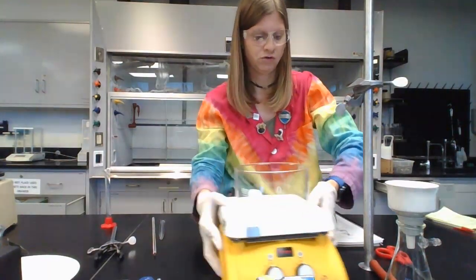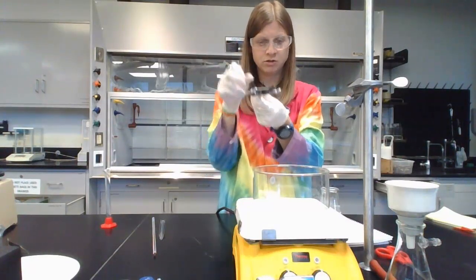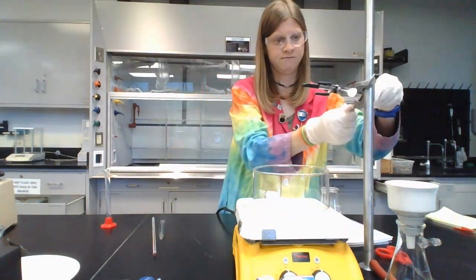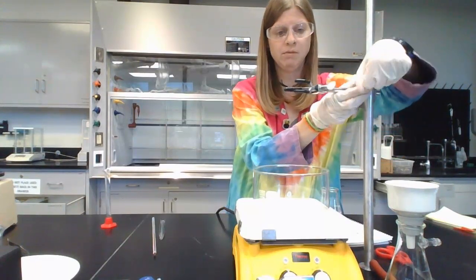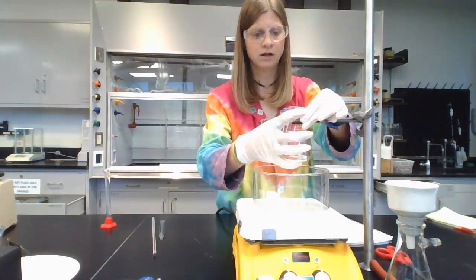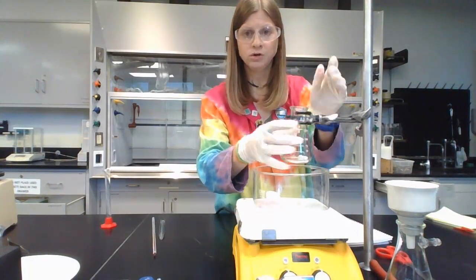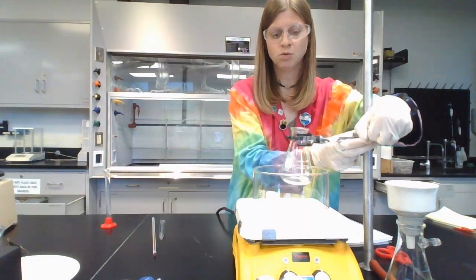I'm gonna scoot you over. And then I'm gonna get a finger clamp, call it that because it looks like a thumb and 2 fingers to me, and attach it to the other side of the knuckle clamp, further out, there we go. And then we're going to be using the finger clamp to tighten and hold the Erlenmeyer flask in place. Then you can lower it down so it's submerged in the water bath.